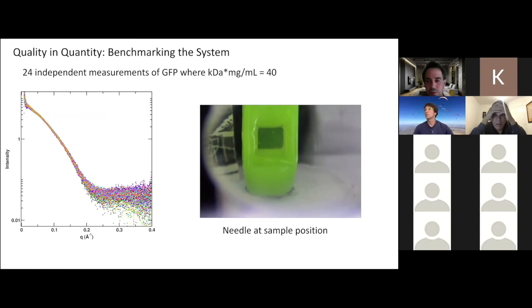If you can see the movie going, you can see it changing from clear to green. And these are repeat buffer sample collections. And of course, I happen to choose an aggregated version of this for this example, but that's what I made the movie from. All right, moving on.